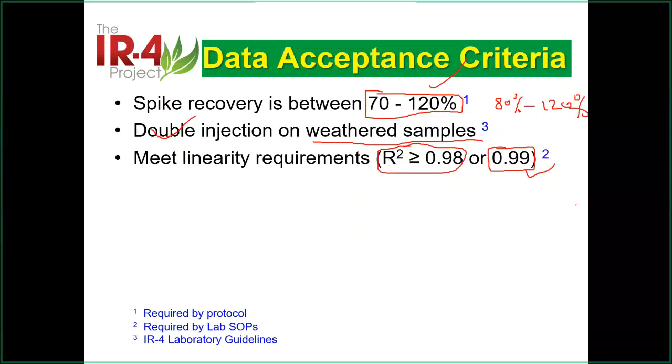Okay. Another question, Dr. Farr asked, how often and what compounds do you use for internal standard in multi-class pesticide residue? Well, we have to say a couple of things on the side. Our work is residue studies, like these pesticides, the mitigation study, or registration or JMPR submission, which most likely is what we are talking about at this time.